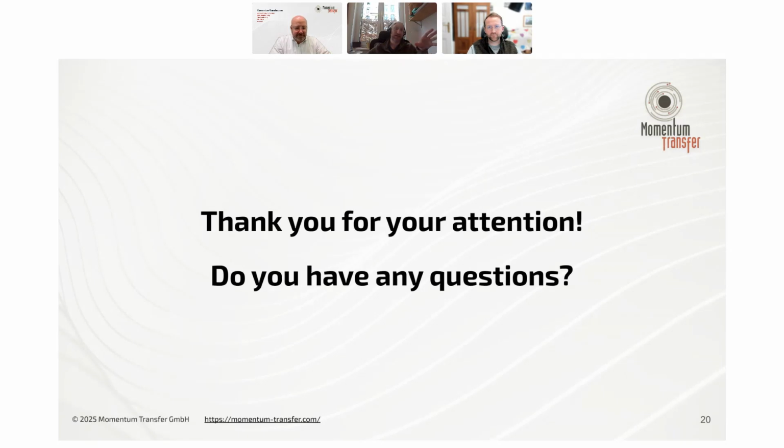We have tested quite a lot of data from different sources, different synchrotron beamlines, and also different lab sources, and gotten positive results in many of those cases. So that's why we still provide that option. But this is something we'll have to provide functionality for in the future, to account for those systematic instrumental changes. But being candid, you should send your samples to us and we provide the data that's optimized for the tool for you.